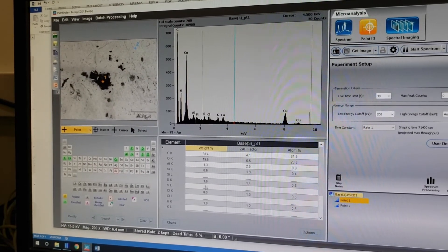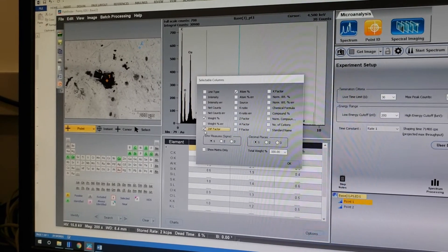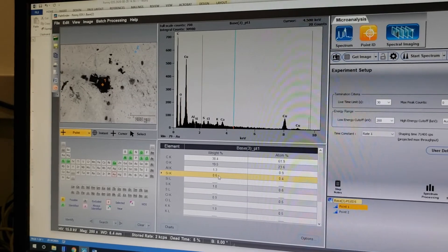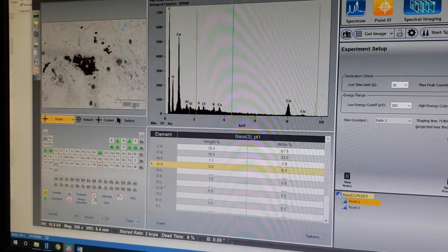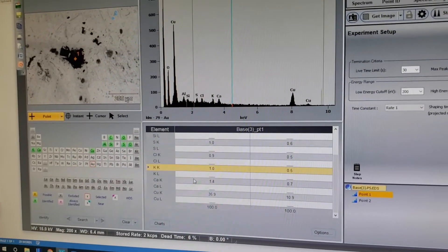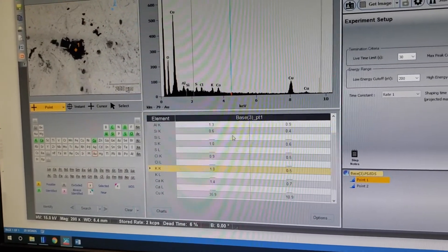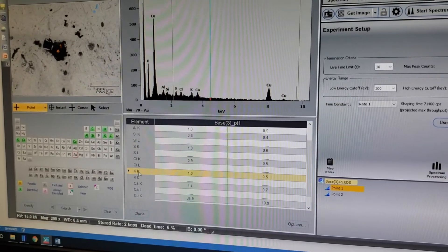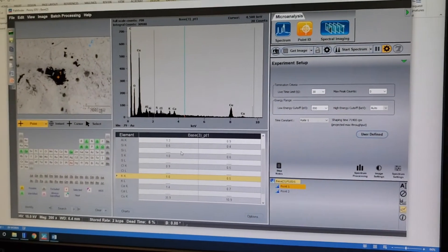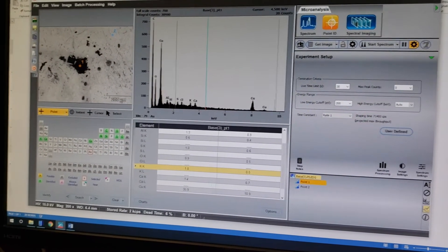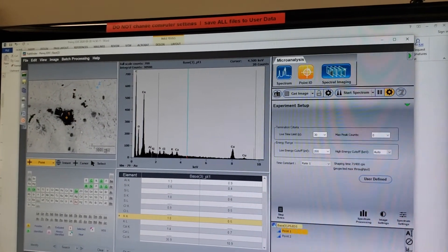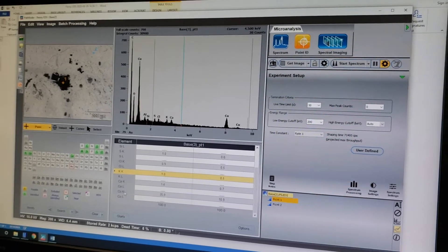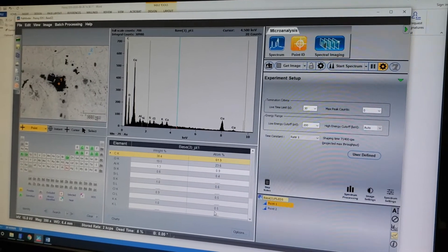All of these things are pretty common in sweat, water, or other contamination from the air and our skin. Silicon and chlorine are both less than 1%; sulfur and potassium are both at exactly 1% — all four are in an uncertain zone. With those being such low values, I'd want to verify them, probably by zooming in to that region only and collecting a couple of points from within that speck.